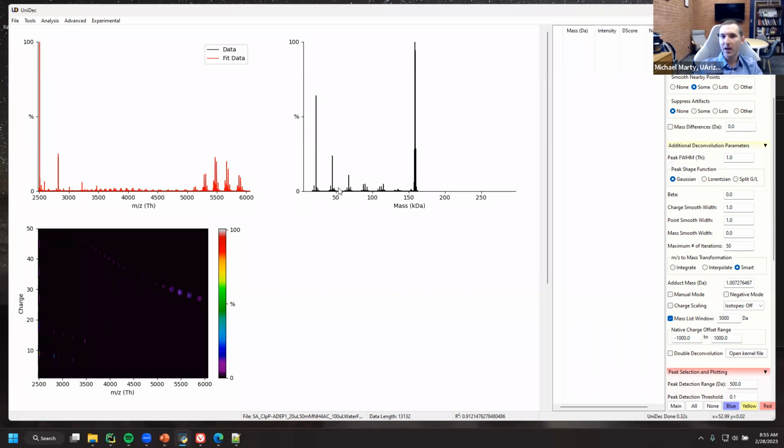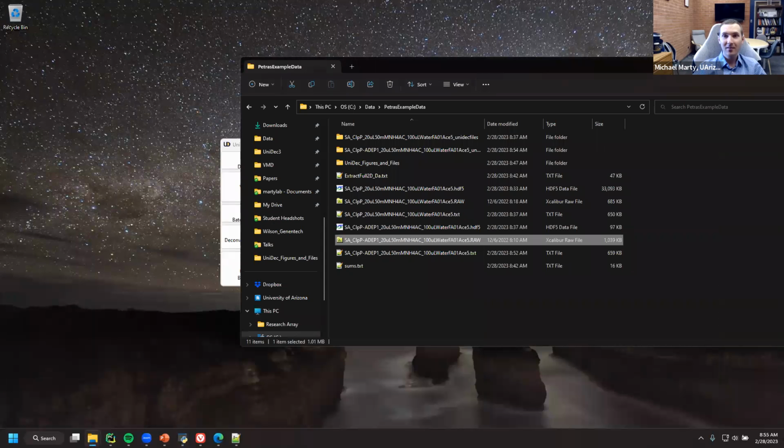We use mostly PyMZML as the library, and they don't have a writer built in. But I know that OpenMS does, and so we have used PyOpenMS for scripts and things. The only downside would be that it would require PyOpenMS as a dependency, but we can make that optional. One thing I could foresee is that we make use of other feature finding tools downstream. Especially working with the guys from MZMine, I would love to deconvolute and then pull it into MZMine also. Yeah, and we could also write a script.